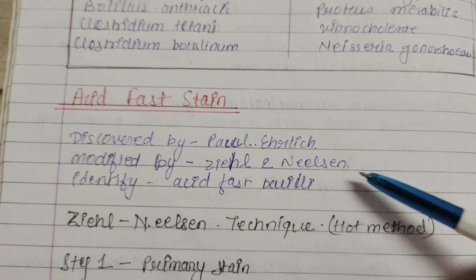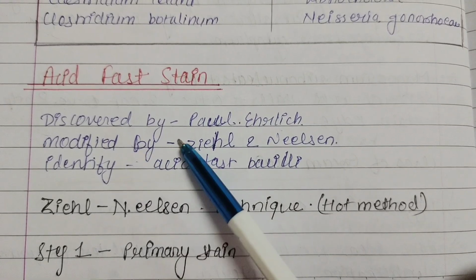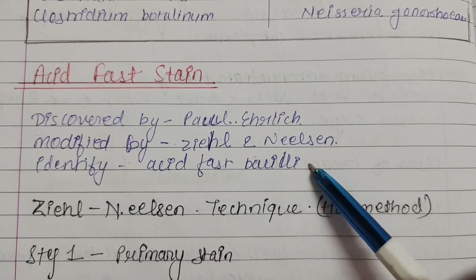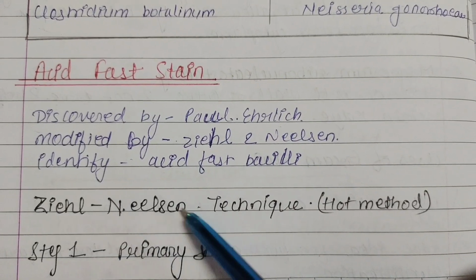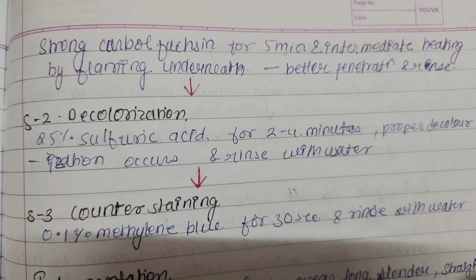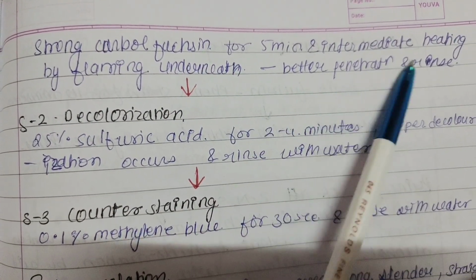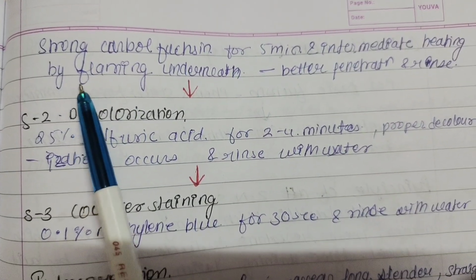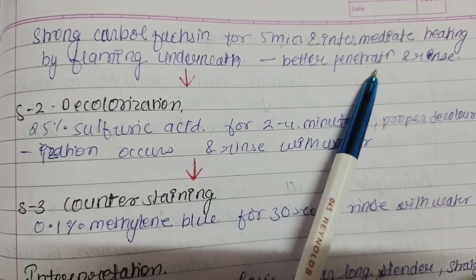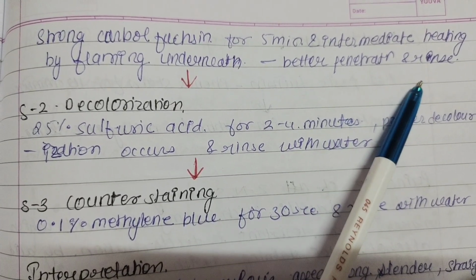Now we will see the acid fast stain, which was discovered by Paul Ehrlich and further modified by Ziehl and Neelsen. It identifies acid-fast bacilli. The Ziehl-Neelsen technique has a hot method, in which step 1 is the primary stain, in which a strong carbol fuchsin is added for 5 minutes and intermediate heating is done by flaming underneath the slide for better penetration of the carbol fuchsin into the cells of the bacteria, and then it is rinsed with water.